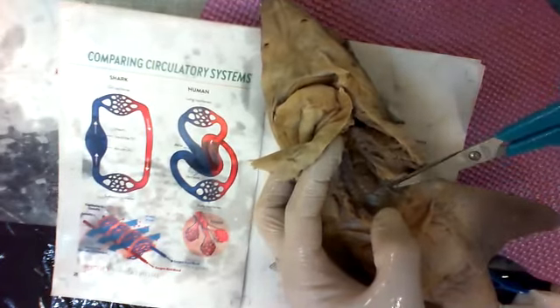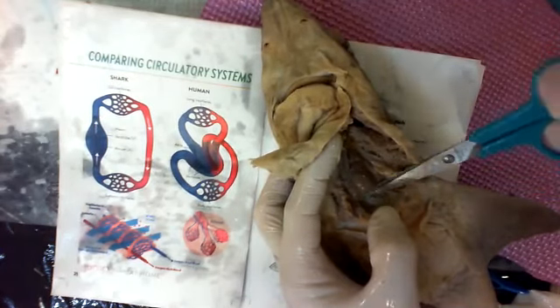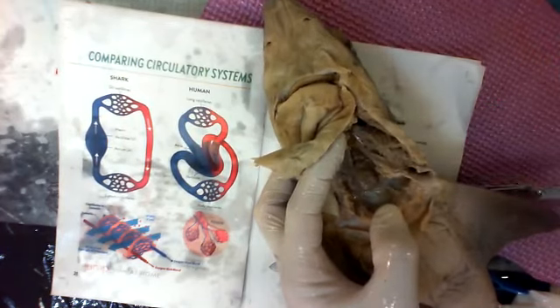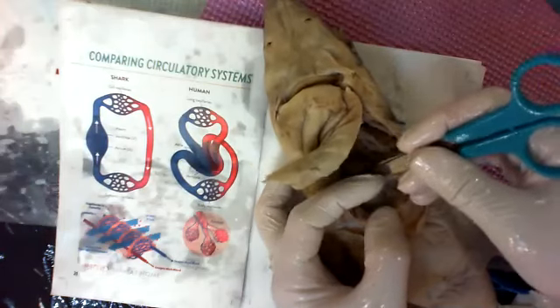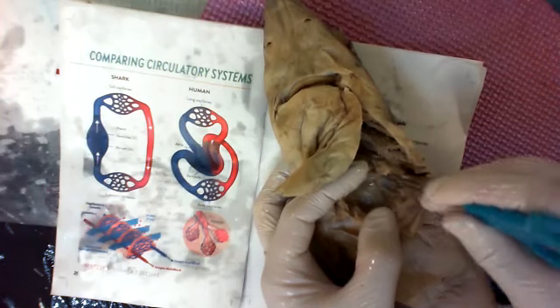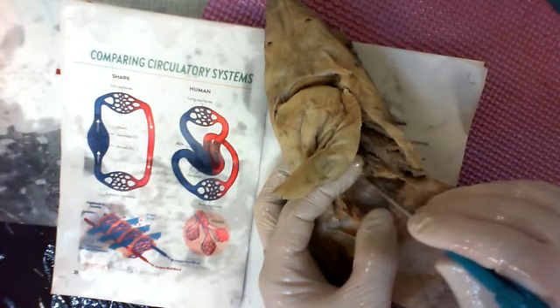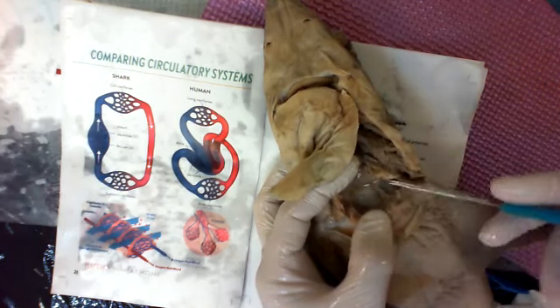I'm going to go underneath it actually, if I can. That pale membrane, I was a little bit wrong. It's not just a membrane. That's part of the conus. Oh, not conus, sinus. See when I push that? I don't know if you can see the little air bubbles. If I get underneath it, I can see air bubbles. That means that is a blood vessel. So that blood vessel is all tied in that membrane.